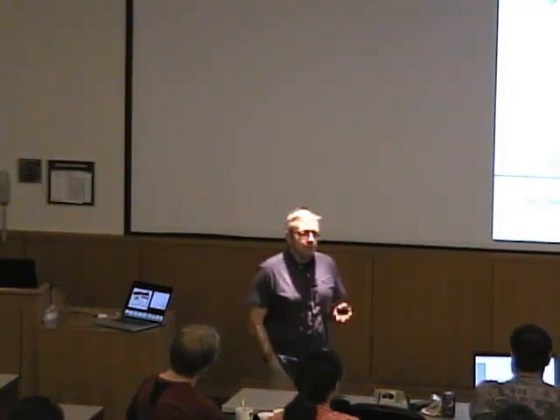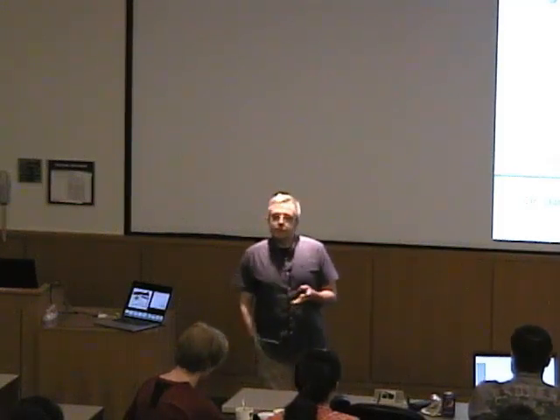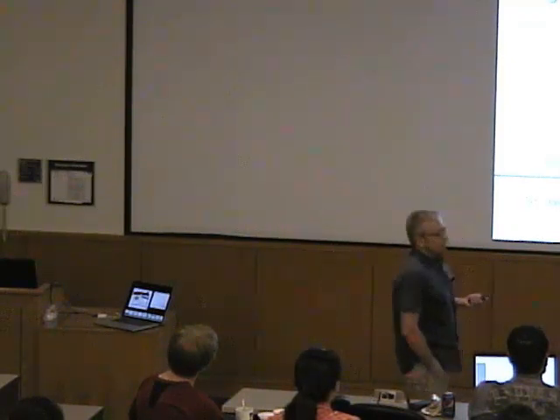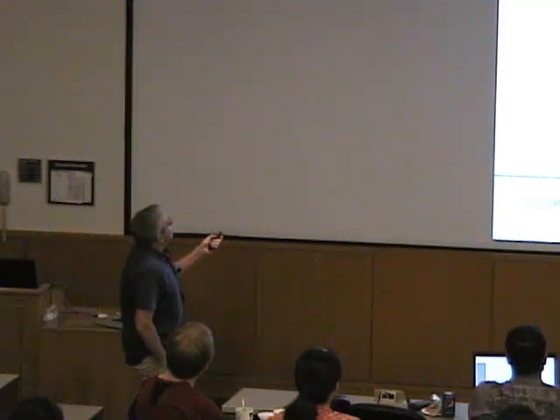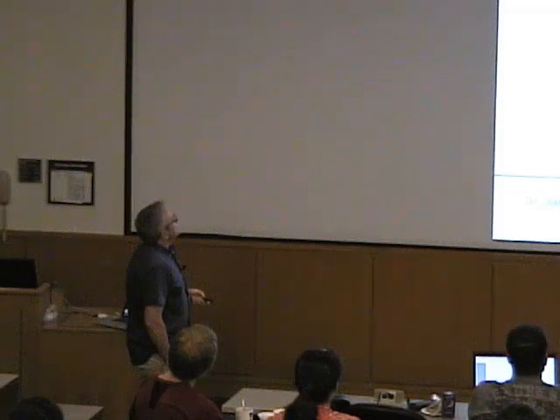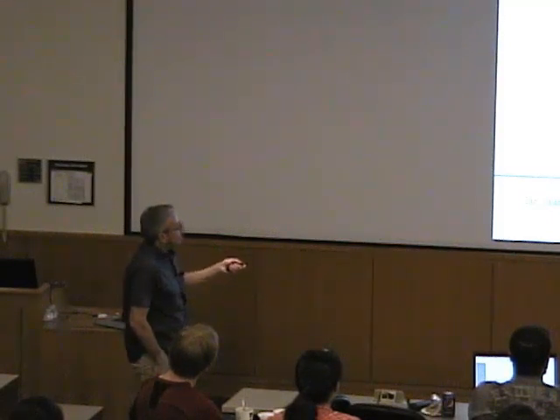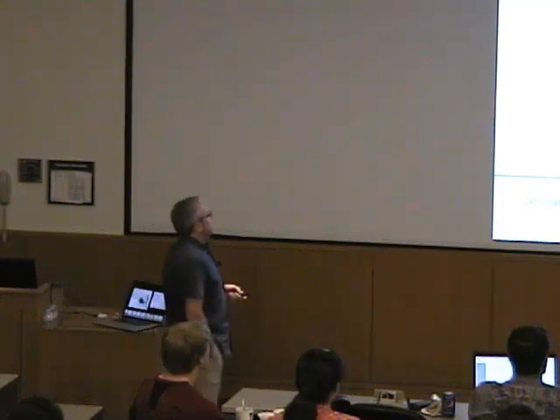So it's extremely exciting what's happening at that point, especially because right now that the instruments come out, a lot of people have really interesting samples in their freezer that they never got crystallized so far. So they just put it in, and they get structures out. And you find things like 2.2 angstrom resolution structures of beta-galactosidase in complex with an inhibitor. If you look at the electron microscopy reconstruction and even zoom in onto that, it looks a lot like what you know from a crystallography paper, right?